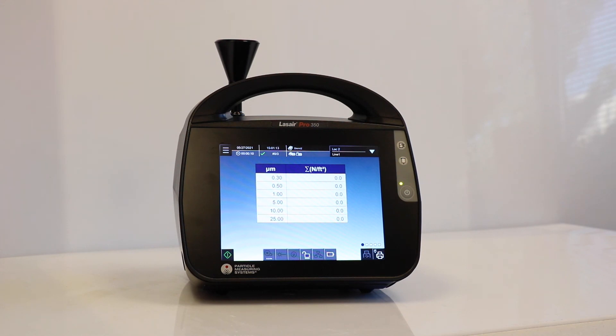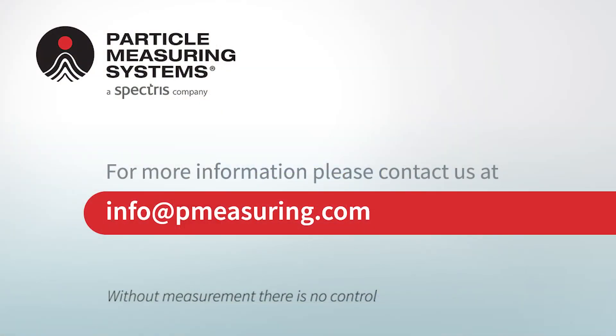You can also export the data to a CSV or XML file onto a USB key.